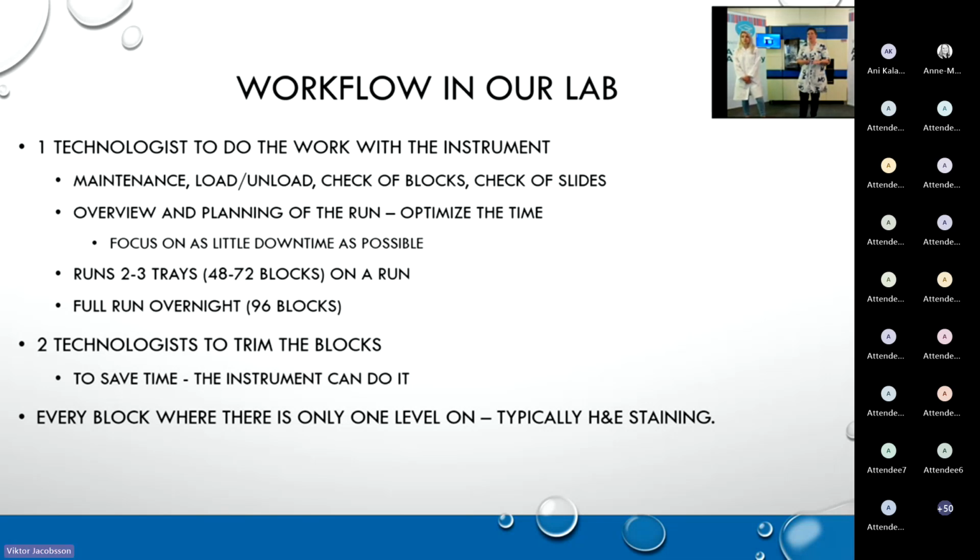In our laboratory, we do runs with 2 to 3 trays at a time. The reason we don't do a full run all the time, because someone will say, just load it full and then you could walk away for 3 hours, is that then your slides will be in the machine for those 3 hours. And we would like to have them further through the process, down to staining and the scanners.